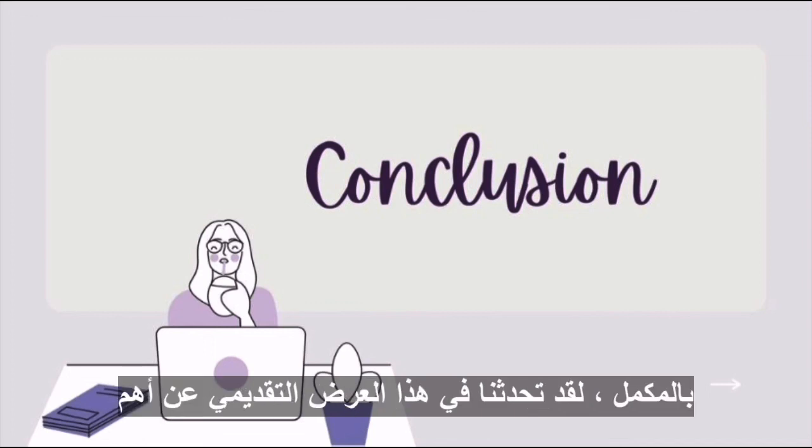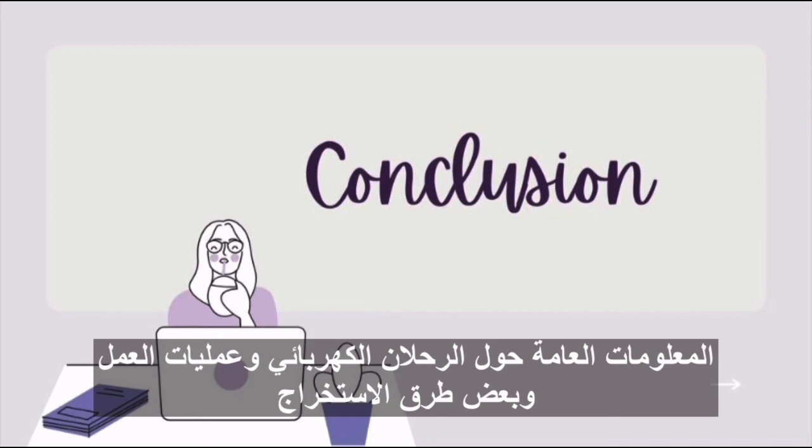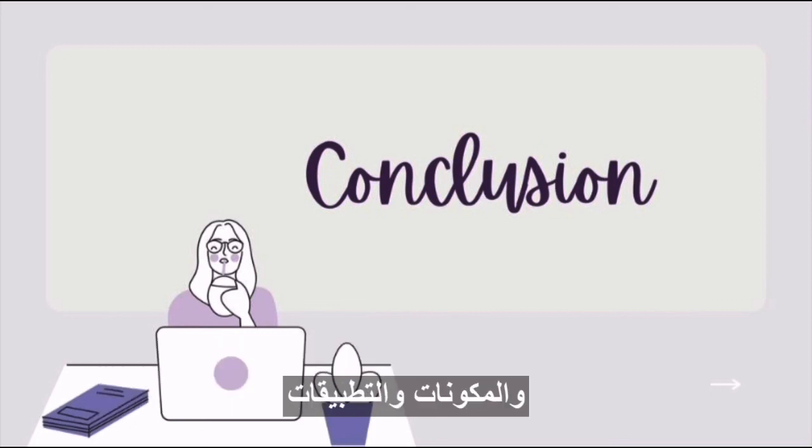All in all, we have talked in this presentation about the most important information about electrophoresis through explaining general information, process of work, some extraction methods, components, applications, and how to measure concentrations.